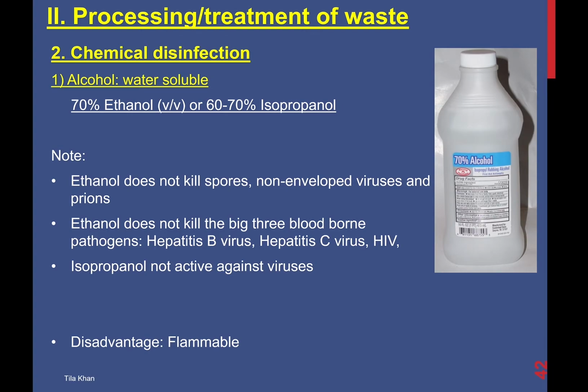And please remember that ethanol can catch fire at any time. It is flammable, so please do not use alcohol near spirit lamps that are on.